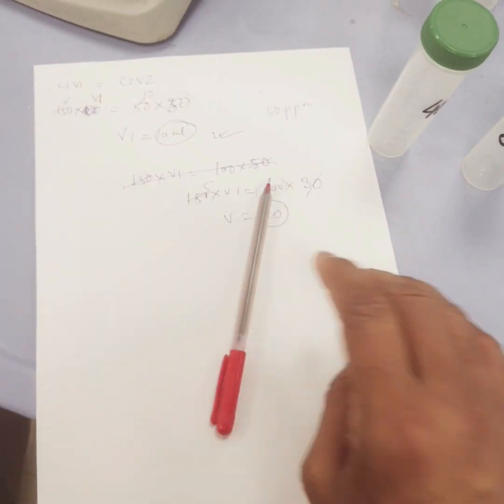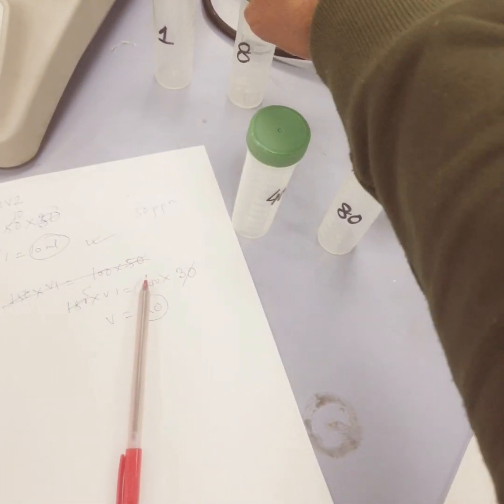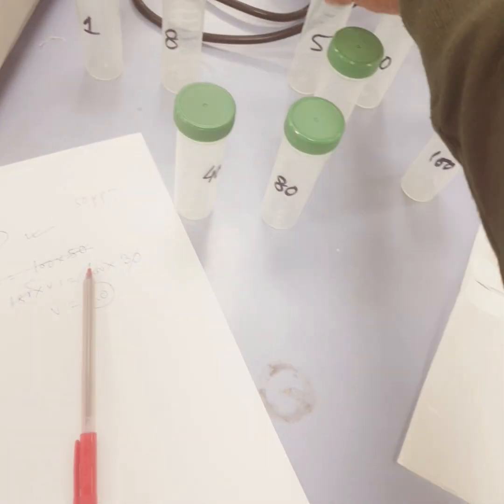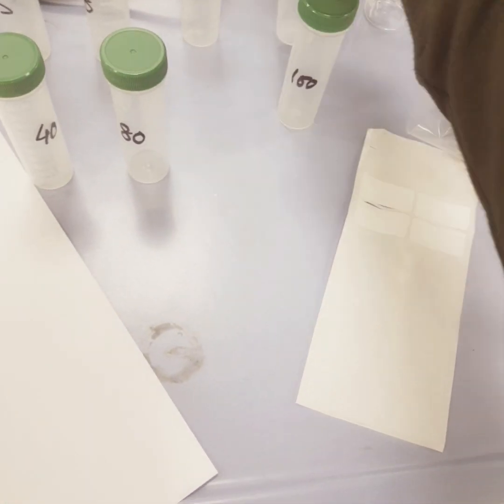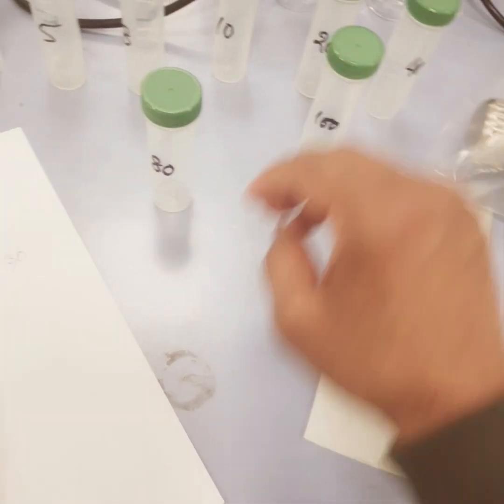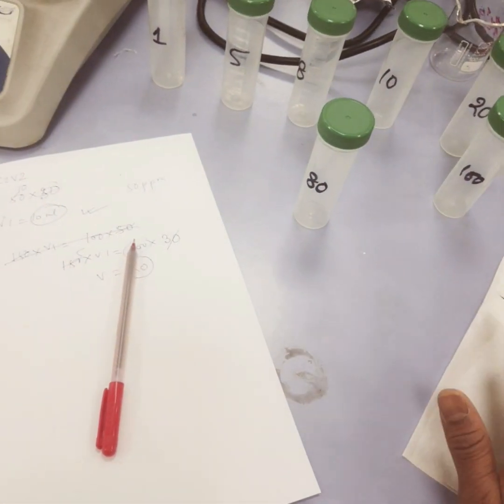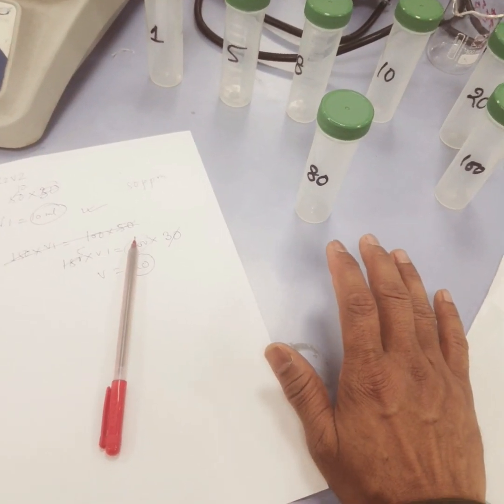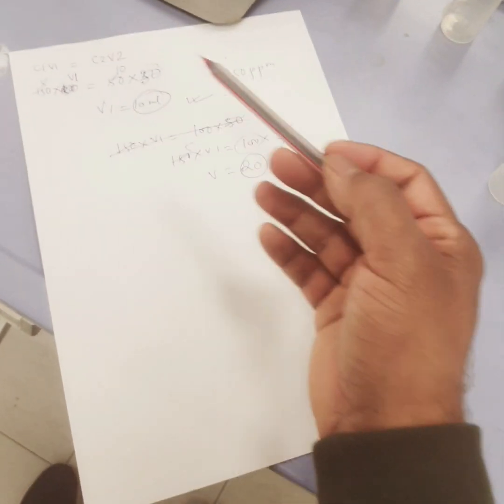So now let's start preparing our next serial dilutions. We'll go through 1, 5, 8, 10, 20, 40, 80 and 100 ppm. Simultaneously we will do the calculation for all the next subsequent concentrations. So this was how much amount we will take for preparing our next concentration.